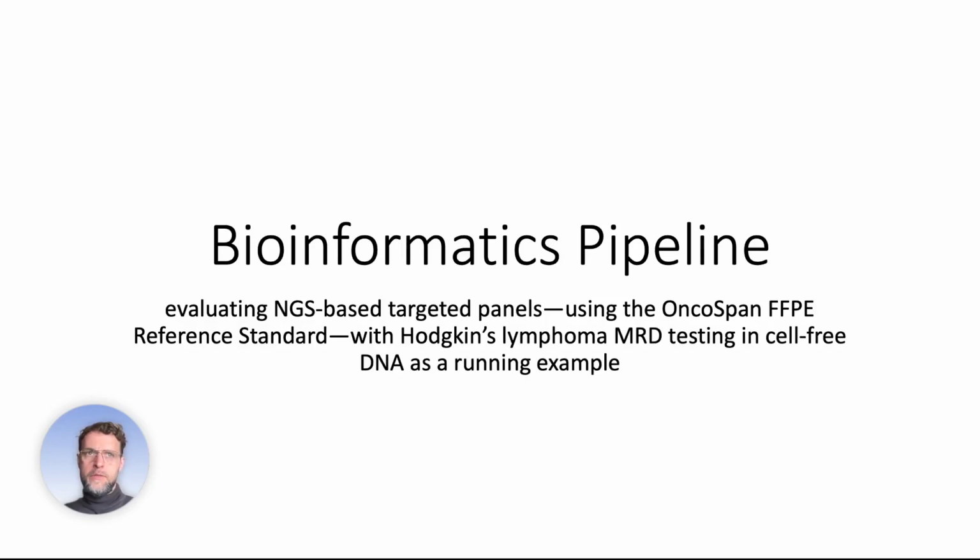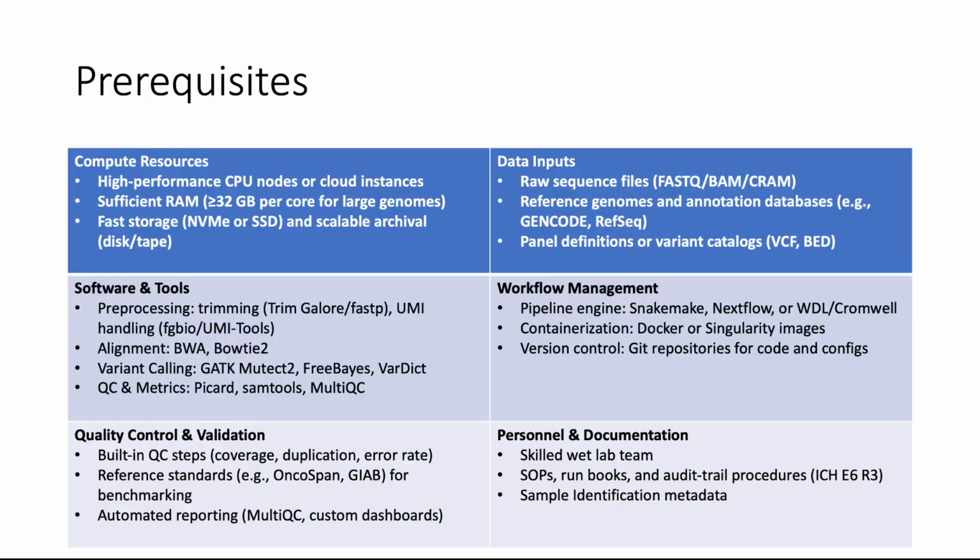So this will be aimed to work with minimal amounts of DNA molecules in blood. So what do we need to have to run such a pipeline?